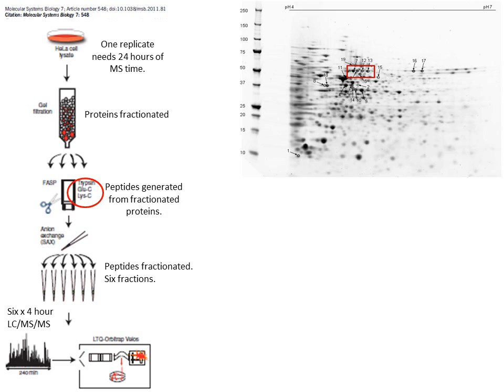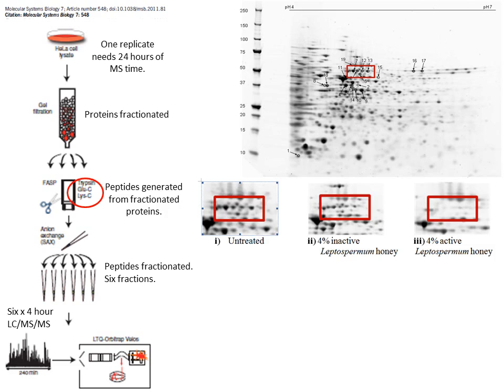Image analysis and densitometry are performed on replicate gels, and differences in the intensity of a certain spot in different treatments can be calculated. In this example from Staphylococcus treated with honey, the numbered spots in the main image are the proteins that show variation in intensity in other gels of other treatments. These images are of the same area.